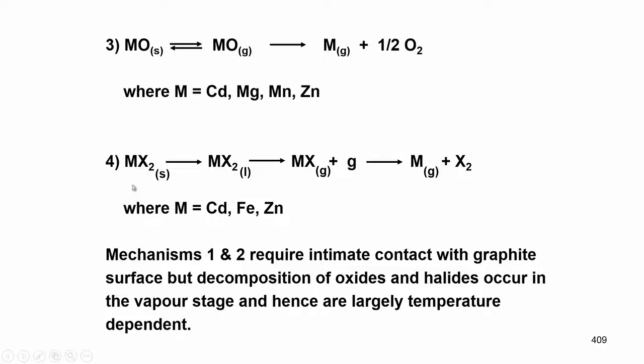Okay. Another one is, suppose I take a chloride halogen salt: chloride, bromide, iodide etc., fluorides.